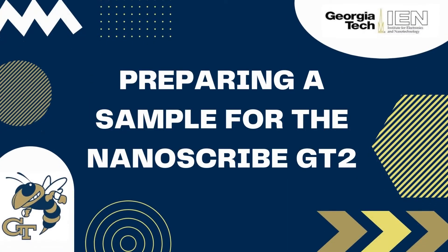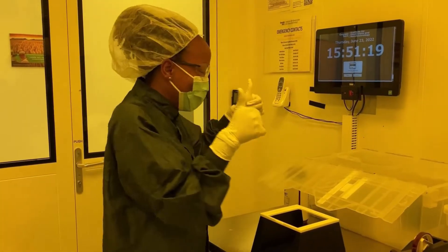Hello, this is going to be a demonstration video showing you how to prepare a sample for the GT2 Nanoscribe here at Georgia Tech.